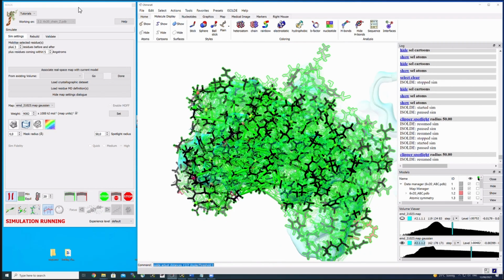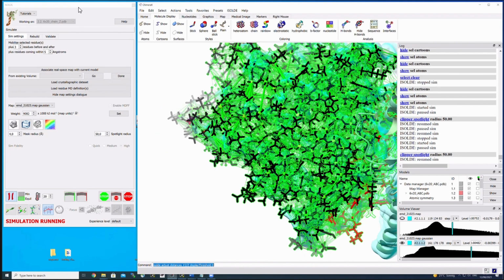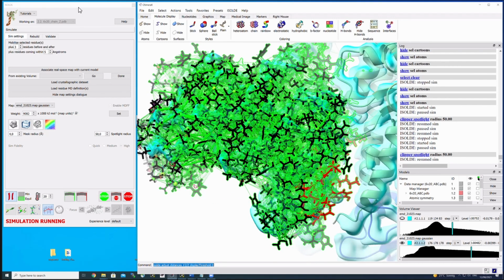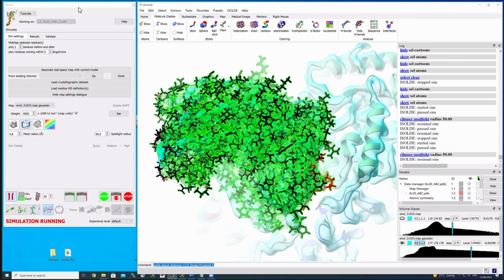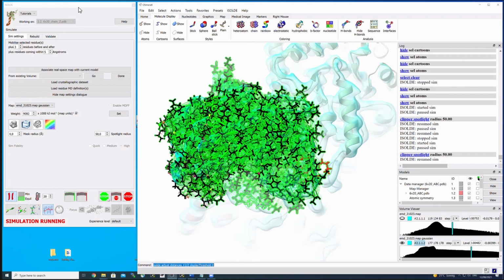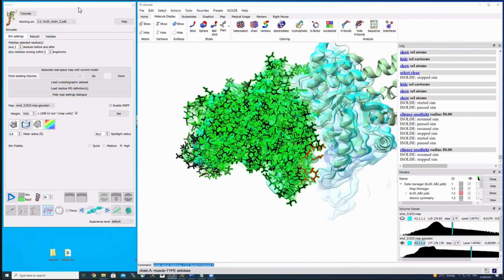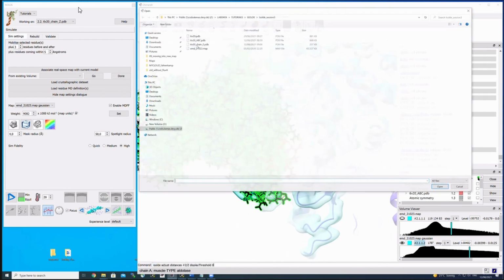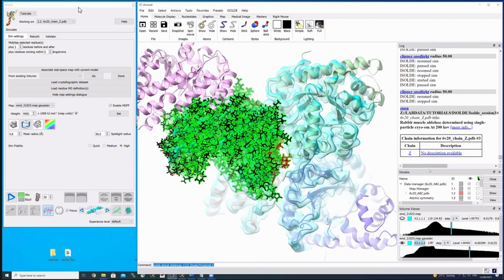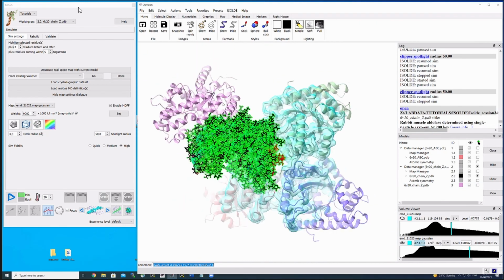So now I will actually save this new position because I know it's correct. And what we can do next is to restore essentially everything in terms of the rotations and the folds. So the backbone geometry and rotamers. We stop the simulation, and now there are two ways of doing that. I think one of the best ways would be either taking the information from one of the other chains, or alternatively we just open the same model again. We don't need it for anything else but taking the structural information.